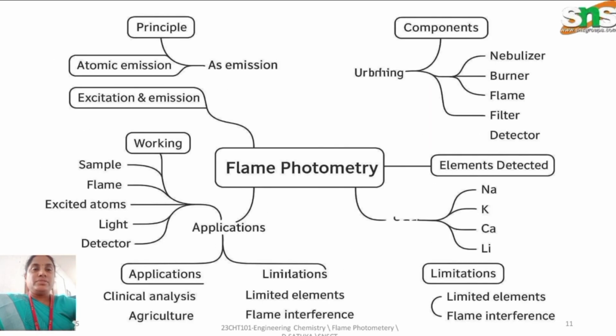This is a question we have discussed: what are the working and applications of flame photometry?